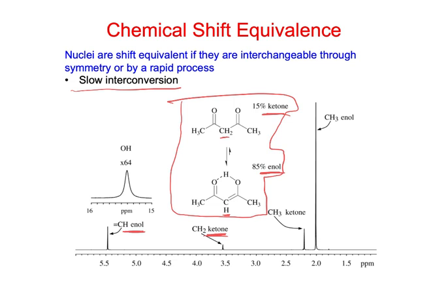Now, for example, if we heated this sample up and the equilibration happened faster and faster, what would generally happen is those peaks would start to broaden out, and then they would almost get lost into the baseline, and then we would probably get a peak that was sharpened up, which would be the average between those two. So if it happens very fast on the NMR time scale, all we see is an average signal. But in this case, it's slow.